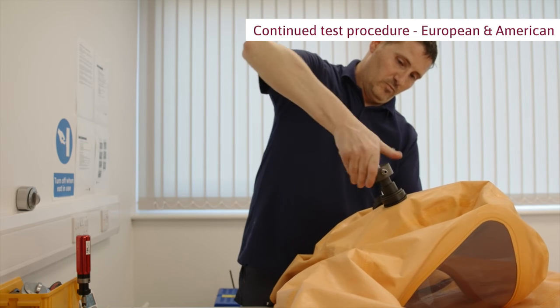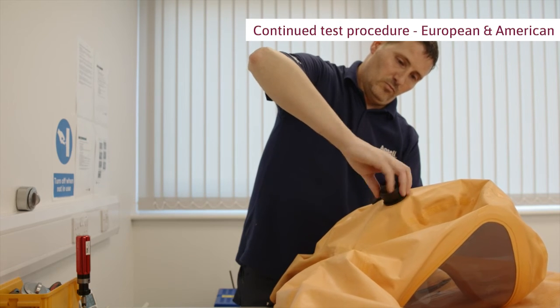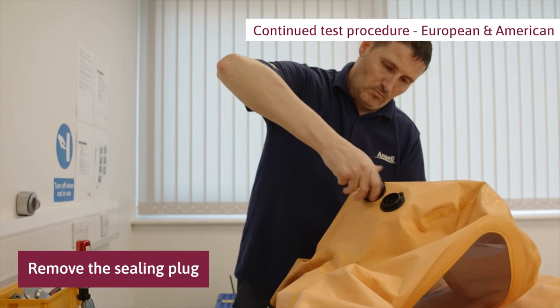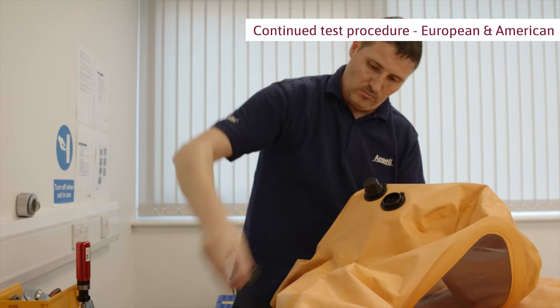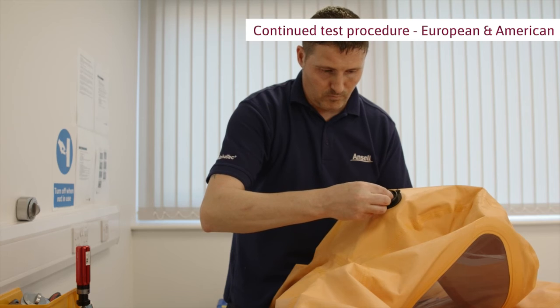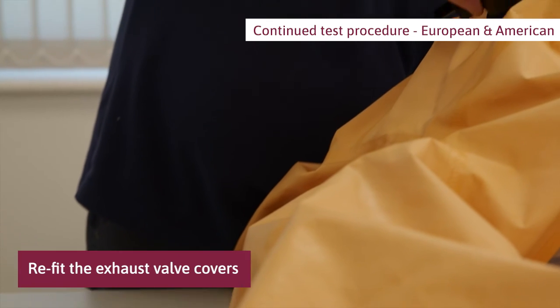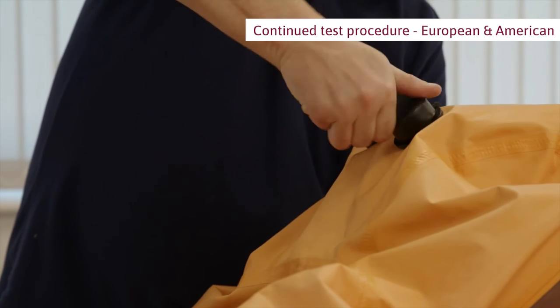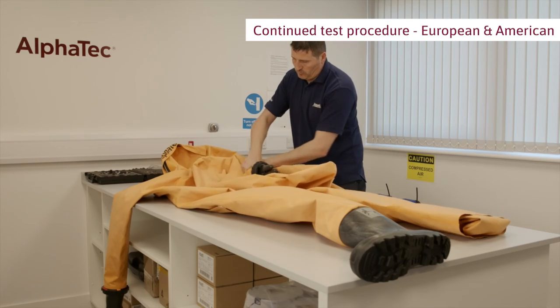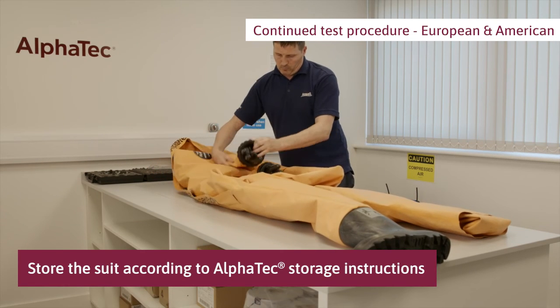Disconnect the manometer from the inflation adapter and remove the inflation adapter. Remove the Alphatech adapter. Remove the sealing plug from the other exhaust valve. Ensure that the removed diaphragm is clean and free from dust. To refit, push the diaphragm center over the retaining pin in the valve body. Refit the exhaust valve covers taking care not to cross thread. Screw the valve cover clockwise onto the valve body, turning the cover until there have been 3 clicks on the cover lug and valve body stop. Fold and pack the suit and store it according to Alphatech storage instructions.